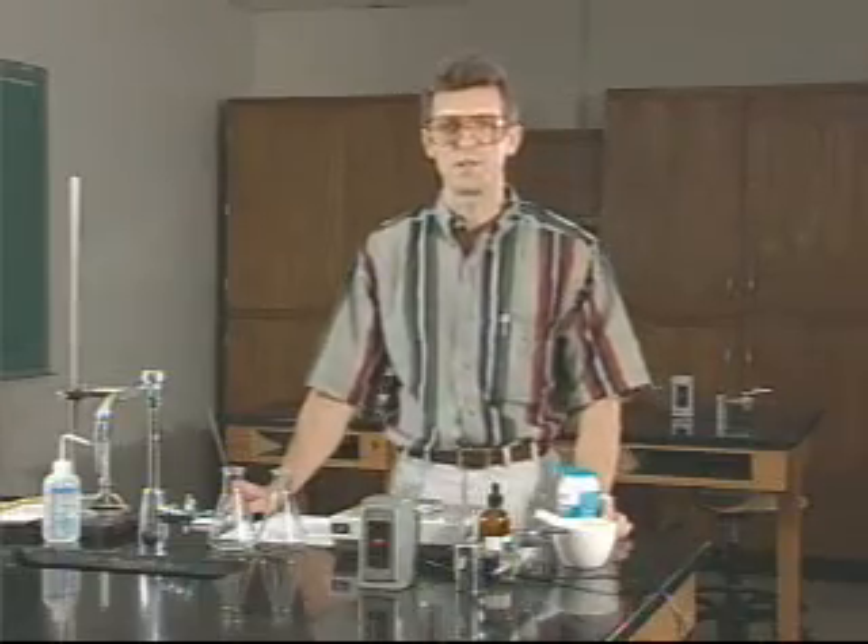I'm Alan Schick, and today I'm going to introduce you to the chemistry laboratory experiment: analysis of antacids. Your stomach normally contains 0.1 molar hydrochloric acid solution, commonly referred to as stomach acid. Indigestion and heartburn can be caused by an excess amount of this acid in your stomach. An antacid's job is to neutralize some of this acid, thereby bringing the concentration back to its normal level.